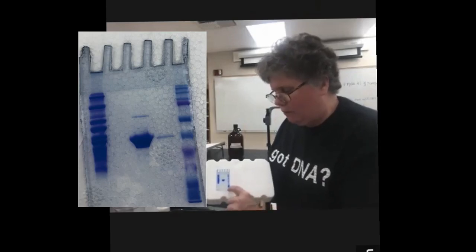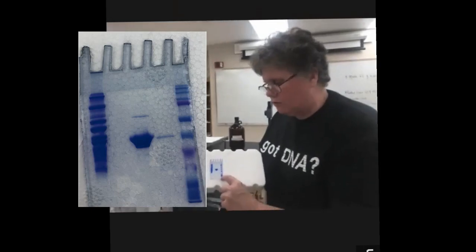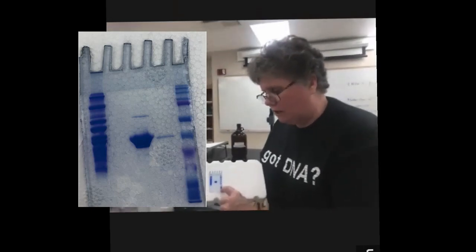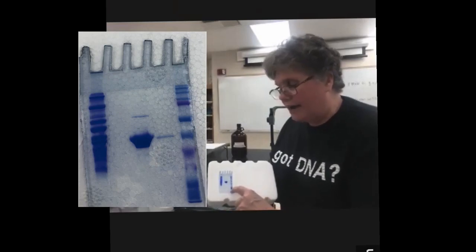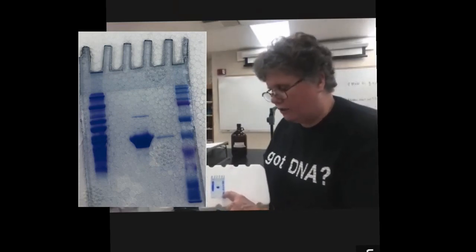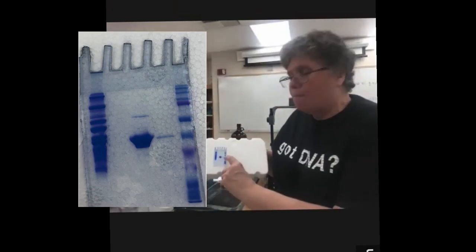So that would be one. So if you were measuring, you know, 2 centimeters, and it's not 2 centimeters, but if you were measuring 2 centimeters divided by 2 centimeters, that's one. If you measured 1 centimeter divided by the 2 centimeters that the farthest anything went, that would have an RF of 0.5.